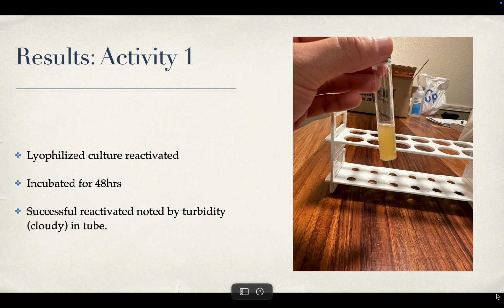These are my results from activity number 1 from the lyophilized culture reactivated. It was incubated for 48 hours and it was noted to be a successful reactivation by the turbidity, which is cloudiness in the tube.